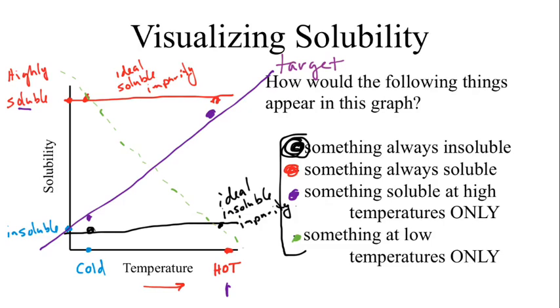And so if we were going to try to purify a target compound, let's look at some possible options now of what we might try to get rid of. Let's say our target compound was mixed with a soluble impurity. How would I get rid of that soluble impurity?